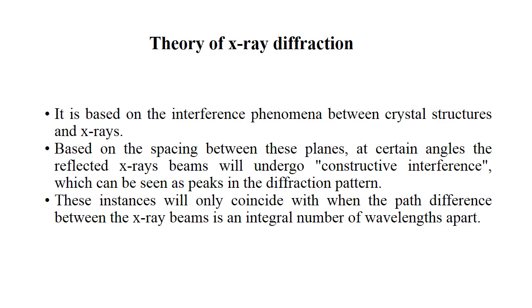If we consider a parallel beam of X-rays impinging on the sample, they will see crystal lattices arranged in planes. Based on the spacing between these planes, at certain angles the reflected X-ray beam will undergo constructive interference, which can be seen as peaks in the diffraction pattern.